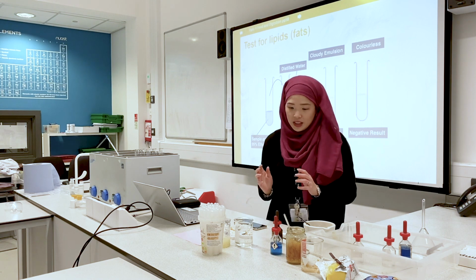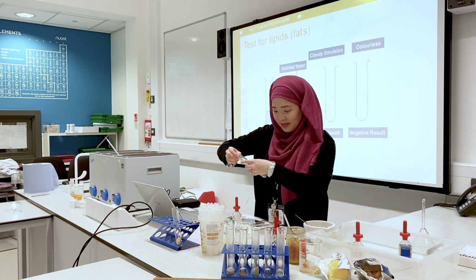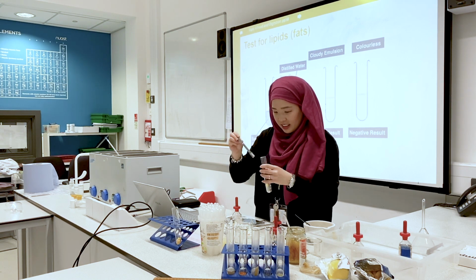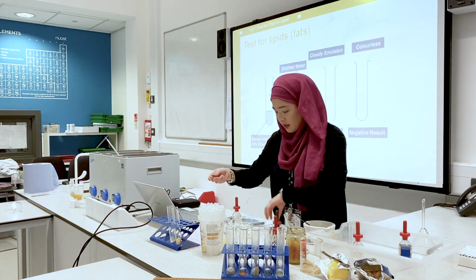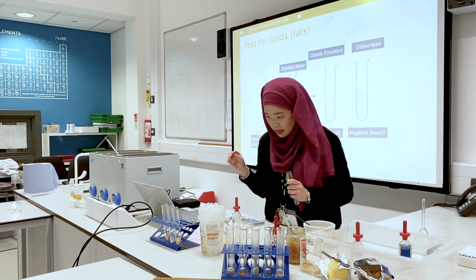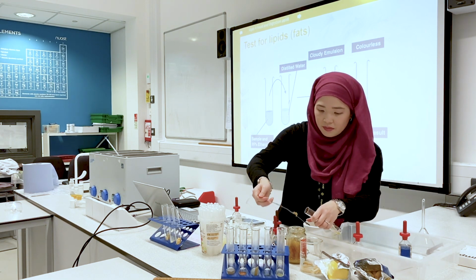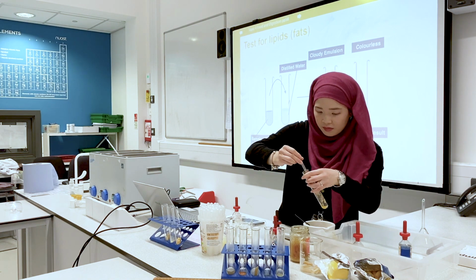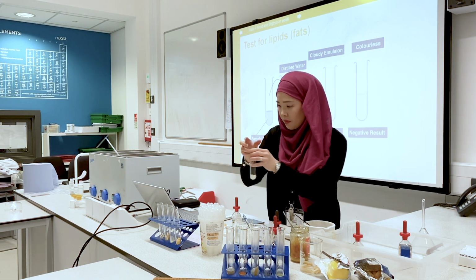Now we are going to test for lipids. Butter, my pasta, and egg.